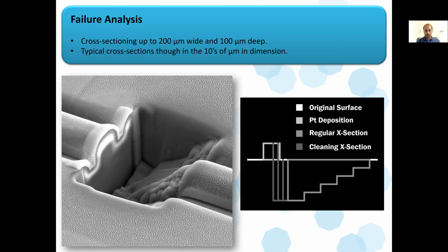The second most common thing beyond just imaging that's done on this system is failure analysis, which typically encompasses producing a cross-section. So people want to use the FIB because it cuts the sample and allows you to see below the surface. So in the previous example, you saw a planar cut where we were just removing a square of material from the surface. Here, the primary purpose is to see a cross-section. So basically, a hole was cut so that we can now look with the electron beam down at an angle at this surface here so I can see what's going on down here, right?